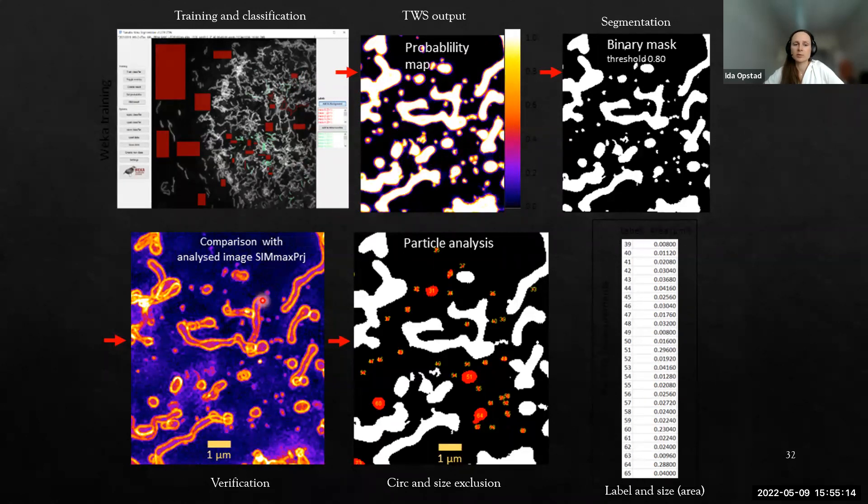Then I did a thresholding of this probability map such that compared to the SIM image, the size of the vesicles looked reasonable how I see the image. I ended up using a threshold of 0.8 for this classifier for all images. I just used the same classifier for fixed and live cells as well, and it seemed to work well.